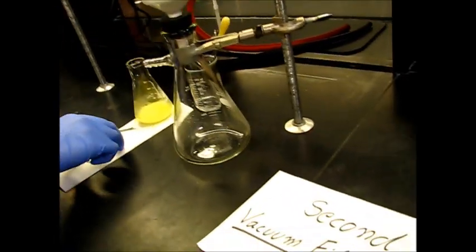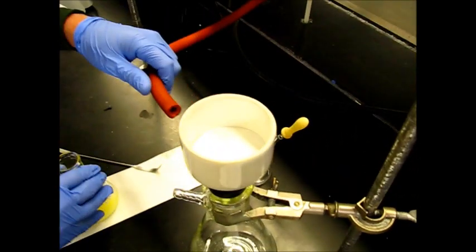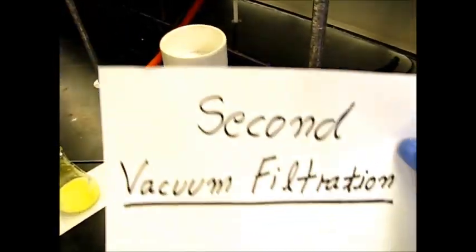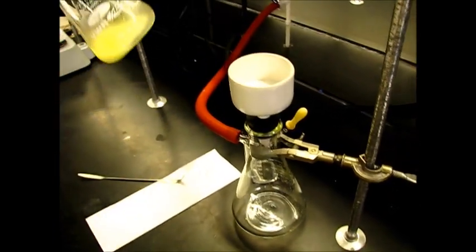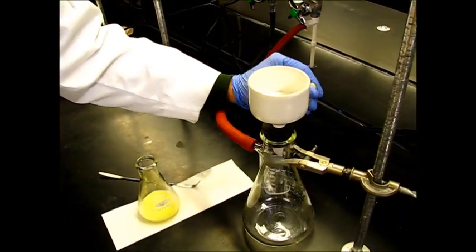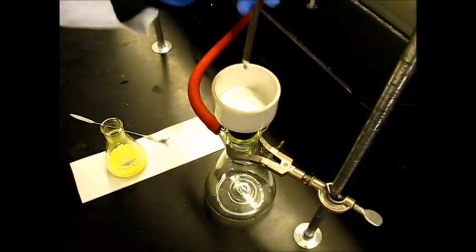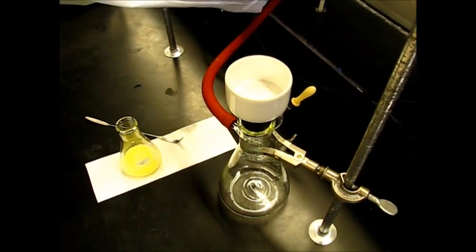First we're going to add our filter paper and connect our vacuum. This is our second vacuum filtration in this workup. Because the product is very fine and powdery, you want to make sure none of it slips underneath. So you want to wet the filter paper before you start, using the same liquid that it's going to be filtered with — just to get a good seal so that nothing slips underneath.